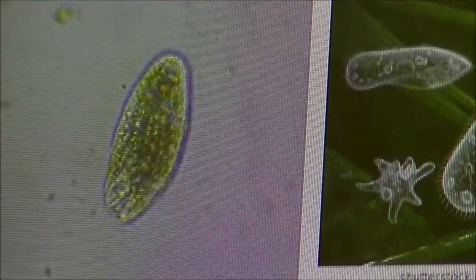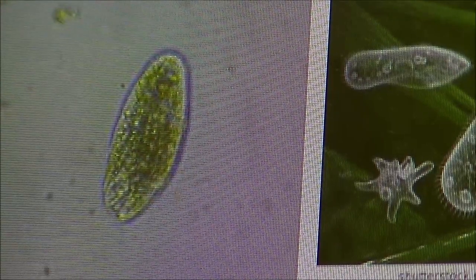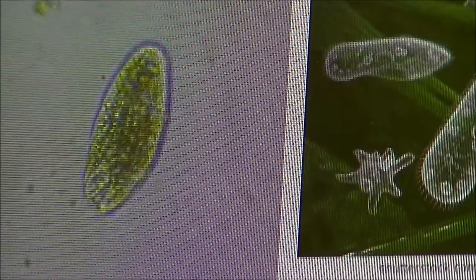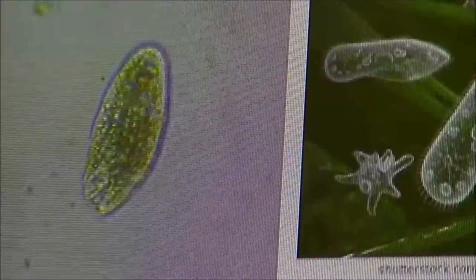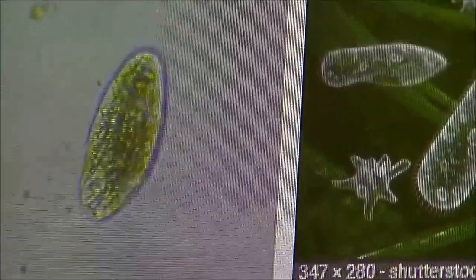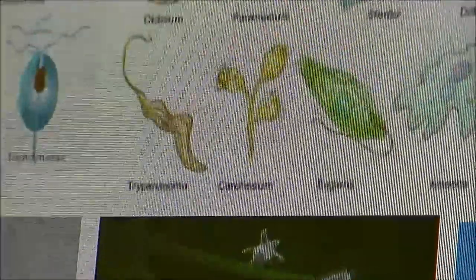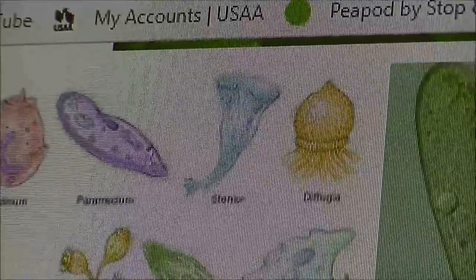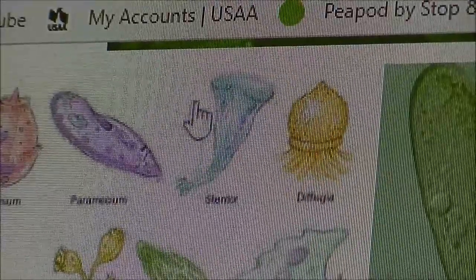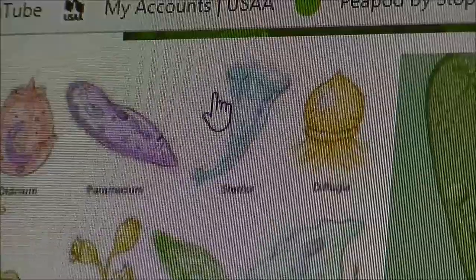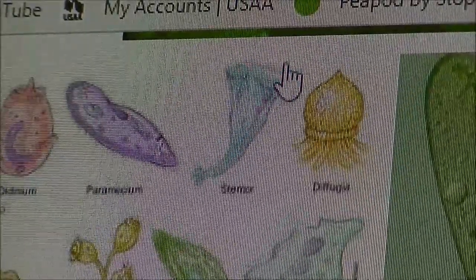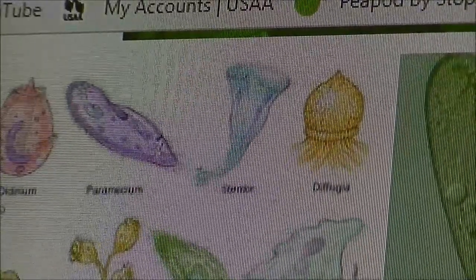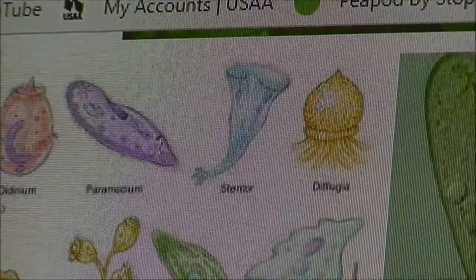There's all different shapes and it will change a little bit because it's decaying and also dying from the little light that I have on the microscope here. I also saw something like this, a trumpet-looking thing, that is also a type of protozoa that will bring in through the mouth and digest them. Let me see what I can do searching around.